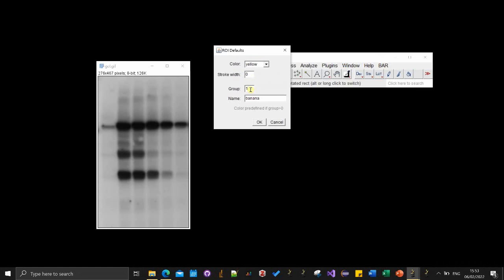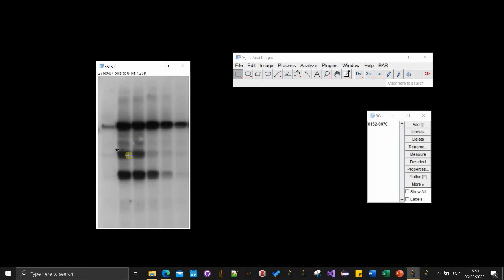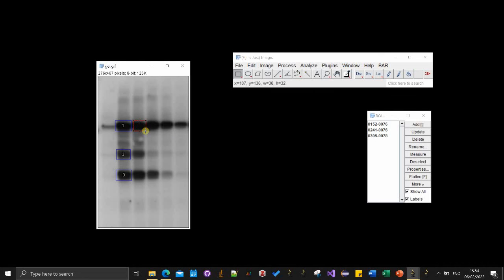let's say group 1, you can also associate a name to it. Let's say, for a more biological use case, we call it control. And now you can annotate a control region of interest, which are in blue now. So group 1 is always blue. Okay. And let's say I then want to continue with group 2, which would be sample 1 or condition 1, whatever. And you see now we have the color red. Every time I'm pressing T to add it to the ROI Manager.